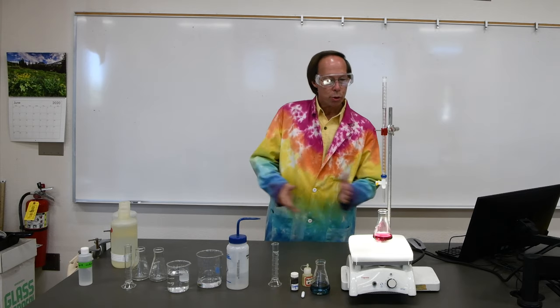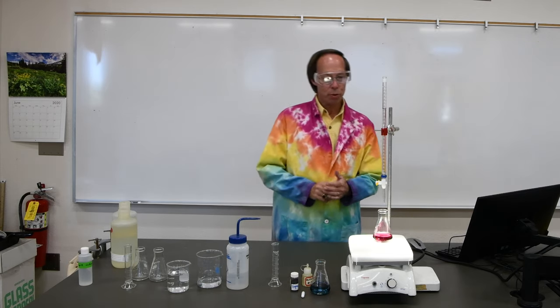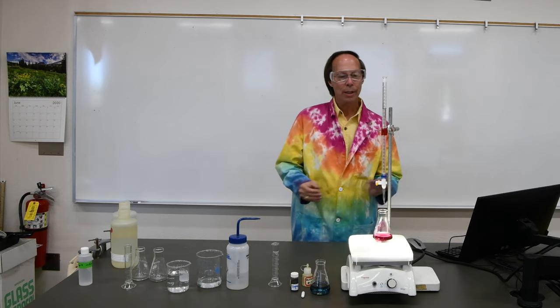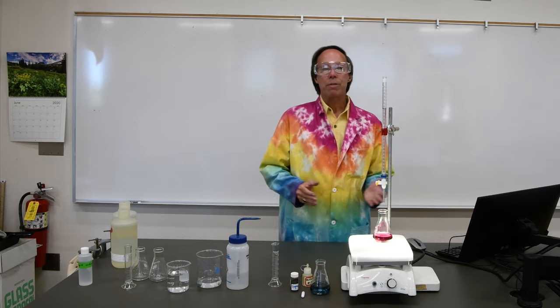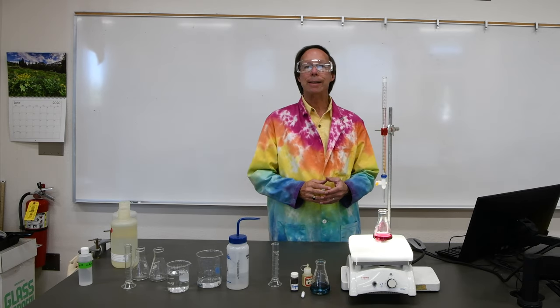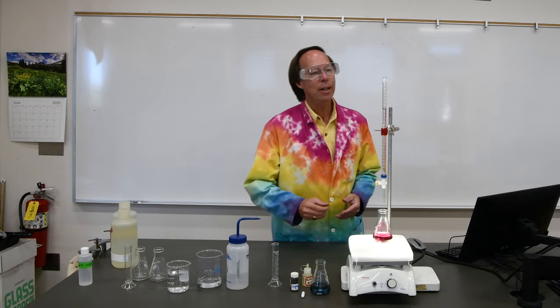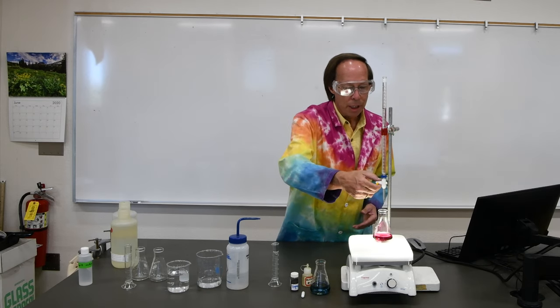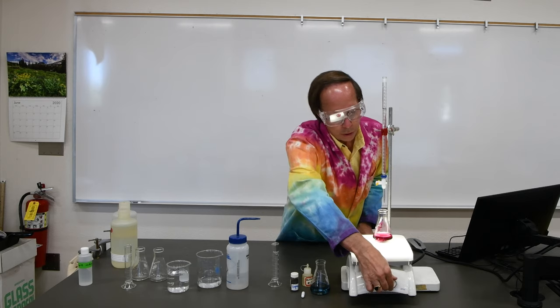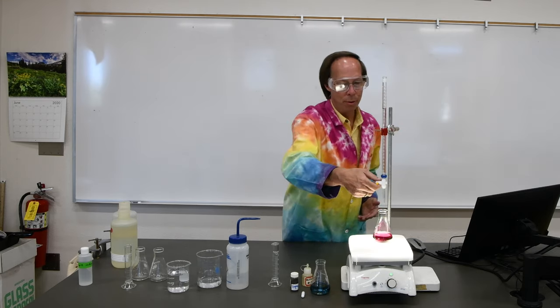All right, we're ready to do the second trial with our standard calcium carbonate. The first trial looked like it worked real well. This time, instead of 25 milliliters, it was only 24 milliliters, so it should take a little bit less, still around 6 milliliters of EDTA. So let's go ahead once again and add it fairly quickly until we get maybe 5.5 milliliters, and then we'll slow down.